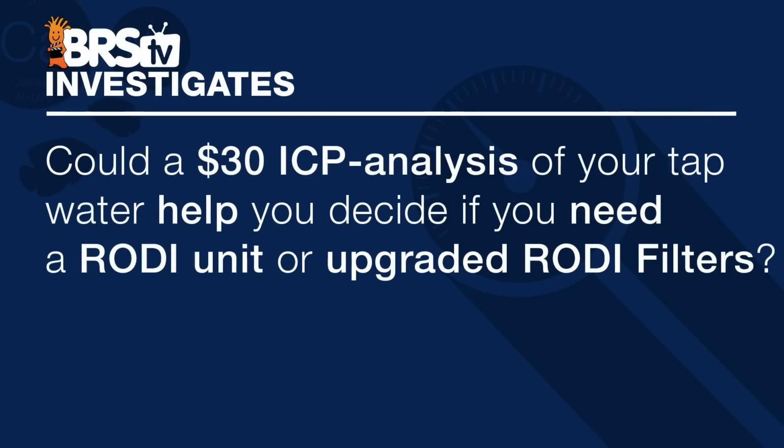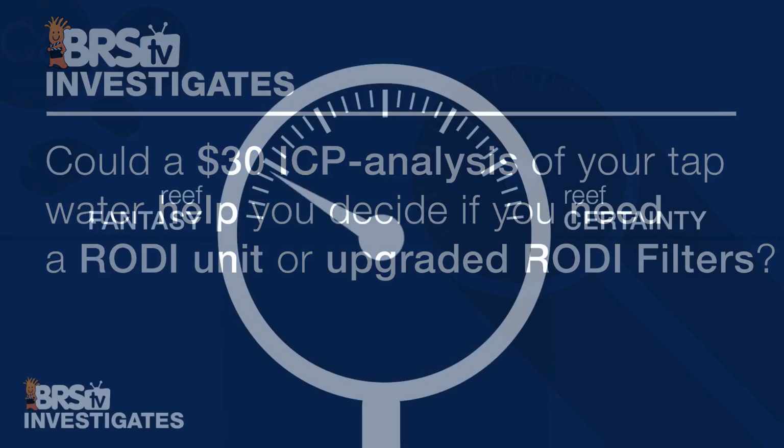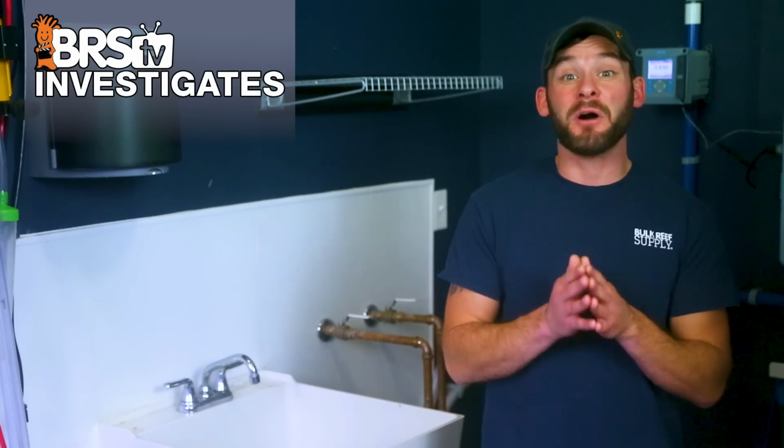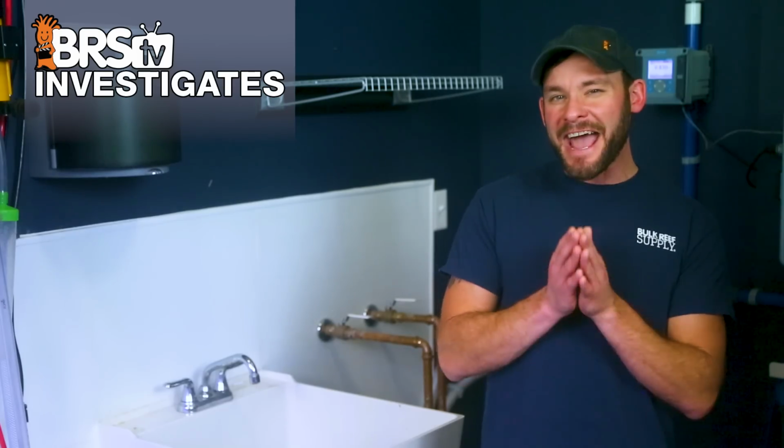Answering today's question, could a $30 ICP analysis help us decide if we need a more or less aggressive RODI filtration approach for making ultra pure water for our saltwater tanks? I'll vote for a 7 out of 10 on our Reef certainty scale, because in almost all water samples we tested today, there were some obvious elements present which we actively try to avoid or remove from our tanks.